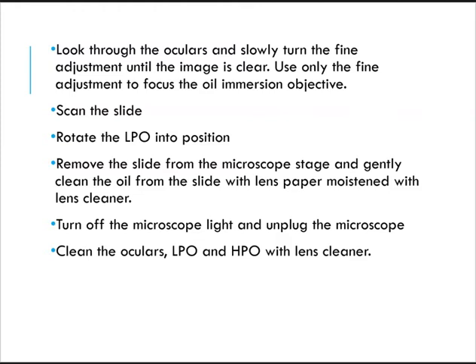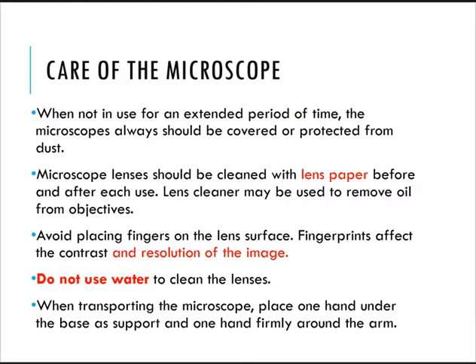paper. Okay, lens paper, guys, not tissue, moistened with your lens cleaner, not water. So we have a designated paper and cleaner for your lens. And then turn off the microscope light, unplug, and clean the oculars, LPO, everything with your lens cleaner. So let's take a look at the basic care of your microscope.